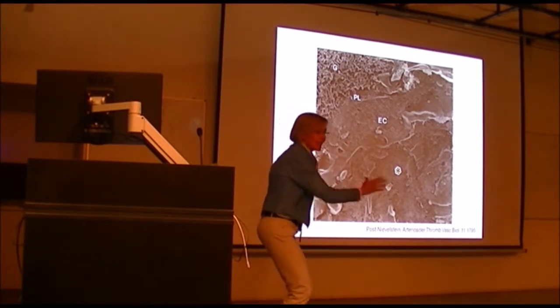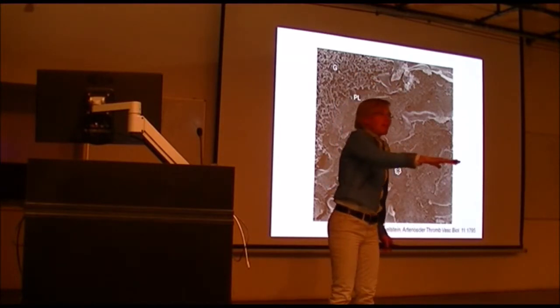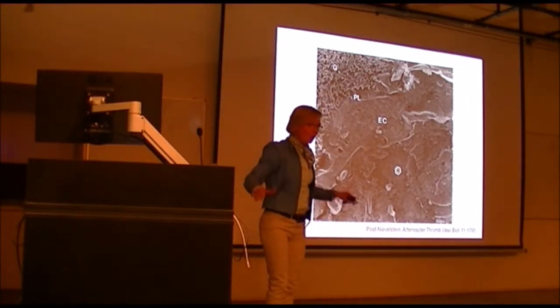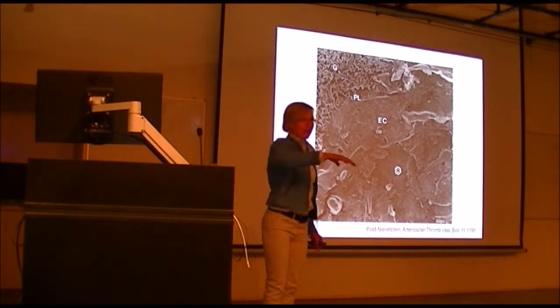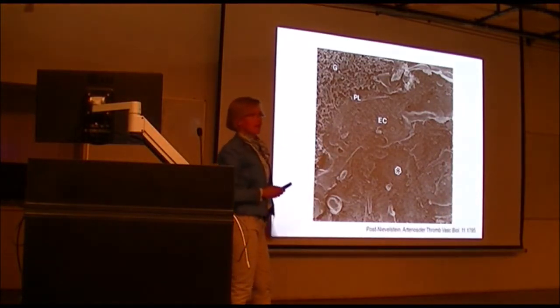You cannot see that in an electron microscope, so you make a cast of platinum on it. It's as if you have a cast, so it's a mirror of it. You digest all the tissue because you cannot use that in the electron microscope, and you purely look at the cast of platinum. And you investigate that in the electron microscope. And you see this. It takes about half a year.